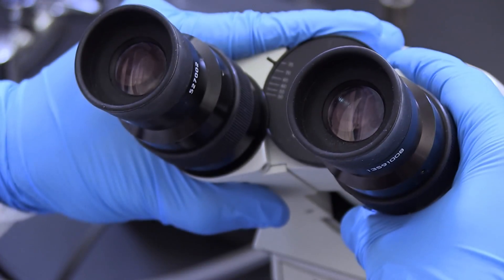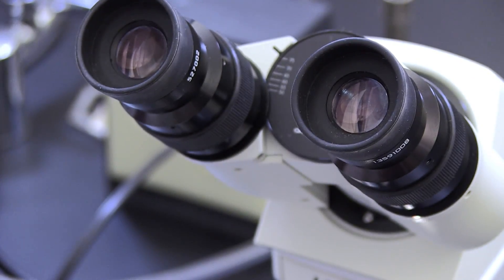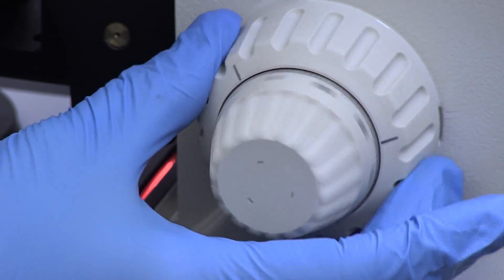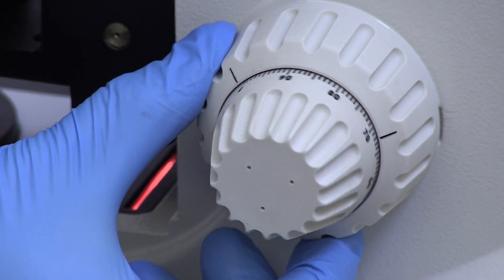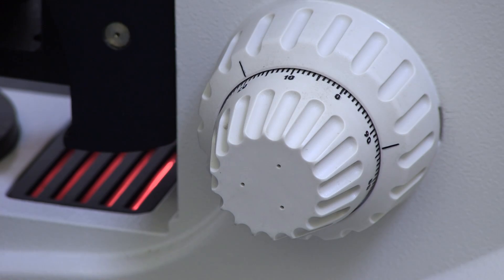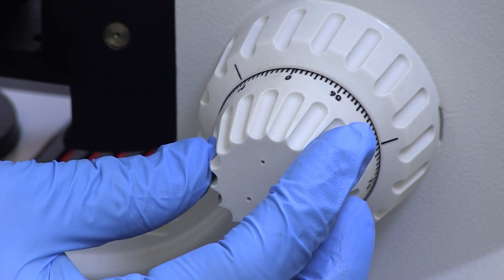Binocular microscopes will also have a means of adjusting the distance between the oculars. Two concentric focusing knobs are located on each side of the microscope. The large outer knob is the coarse focus adjustment, while the smaller inner knob is the fine focus adjustment.